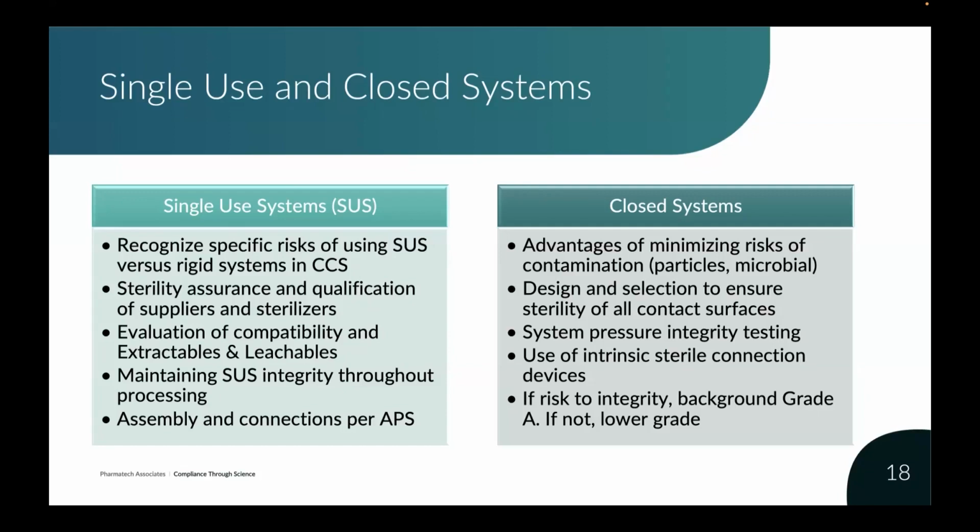So you need to understand that. You need to understand those sterilization documentation to be provided by those suppliers. You need to understand compatibility. You need to understand extractables and leachables.